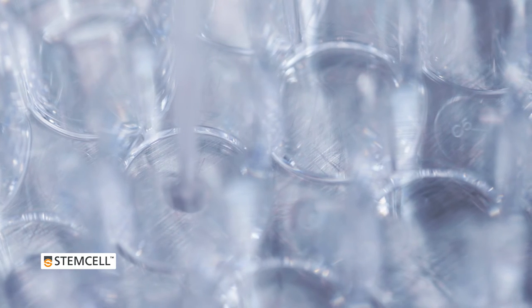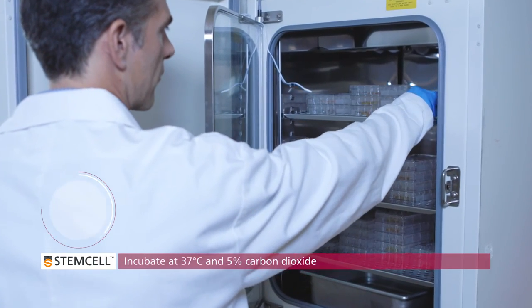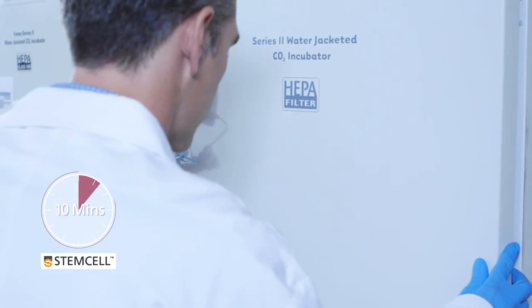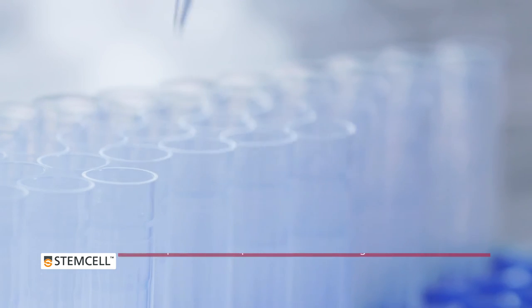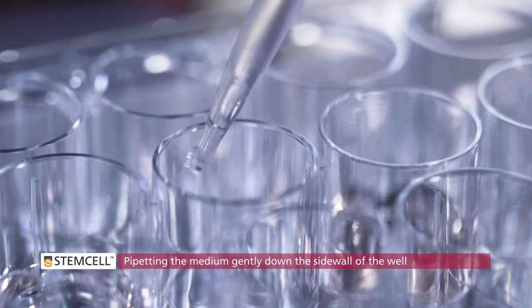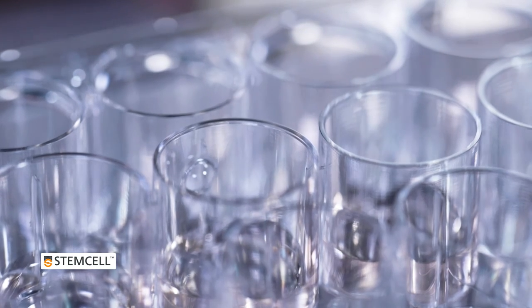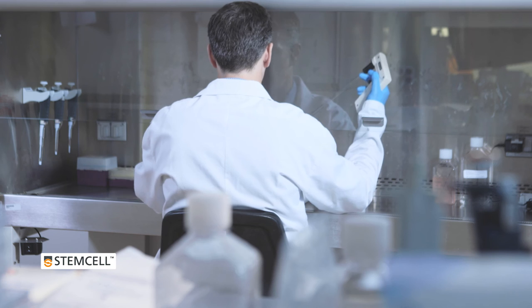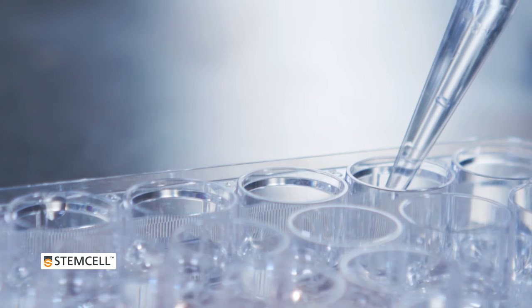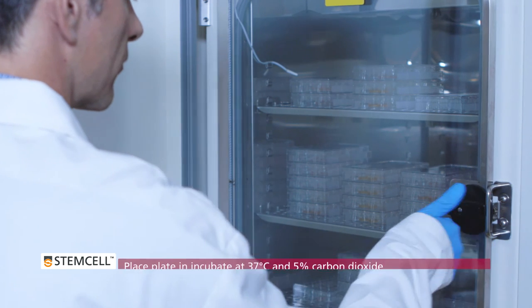The samples should form domes in the middle of each well. Being careful not to disturb the Matrigel domes, place the plate in an incubator at 37 degrees Celsius and incubate for 10 minutes to set the Matrigel. Add 750 µL of room temperature intestinal organoid growth medium to each well by pipetting the medium gently down the sidewall of the well — do not pipette directly onto the domed cultures. Add sterile PBS to any unused wells to reduce evaporation. Place the lid on the culture plate and incubate at 37 degrees Celsius and 5% carbon dioxide.